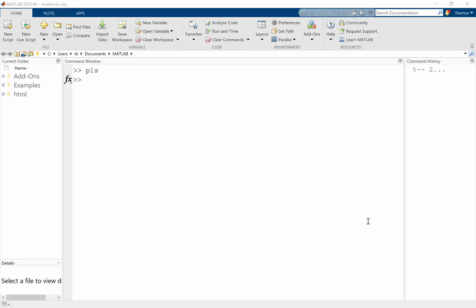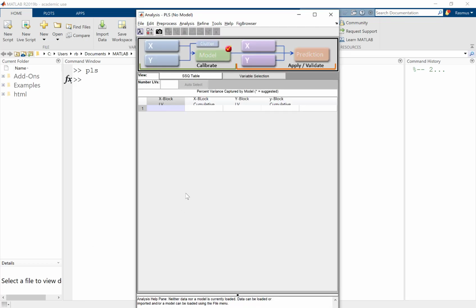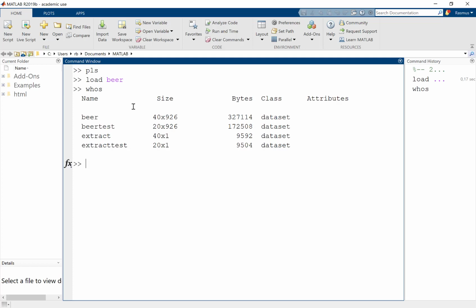In this third video that we added just now, I want to explain some of the newer ways of doing variable selection in PLS Toolbox, because there's a new interface that wasn't present when the original videos were made, and it makes life a little bit simpler.